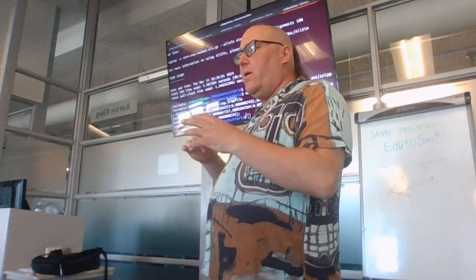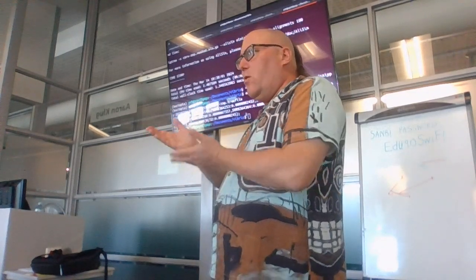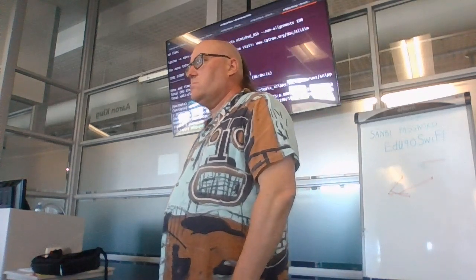But is ASLM not providing any forums for people to talk to each other on the lab side? Is there no network to go to if you say the sequence is not giving me good results? Is there nowhere to turn to? No, we usually contact Nanopore representatives within the region. Yeah, I don't think that's very effective. They'll just tell you what you want to hear.